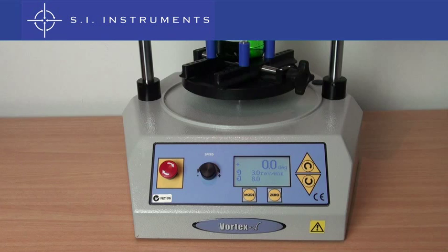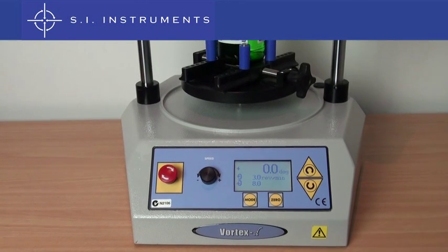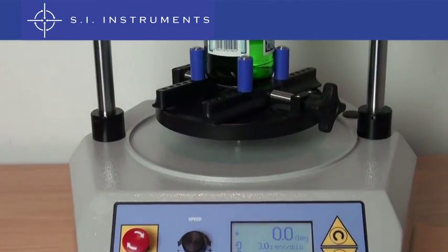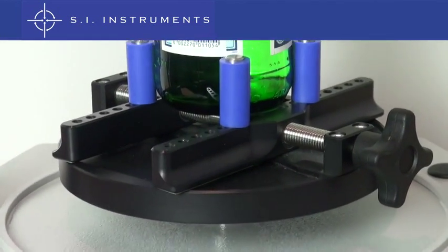The McMesson Vortex consists of a base with electric motor to rotate the bottle at a pre-set constant speed.